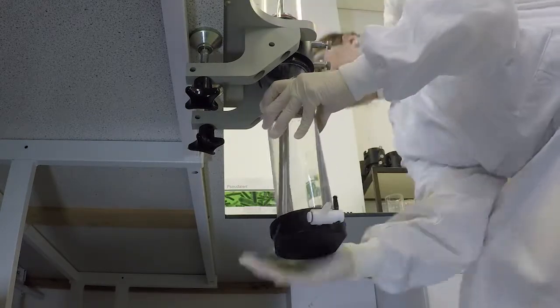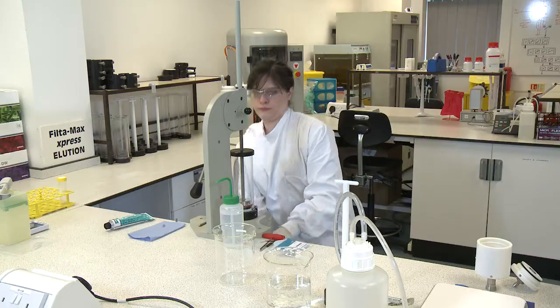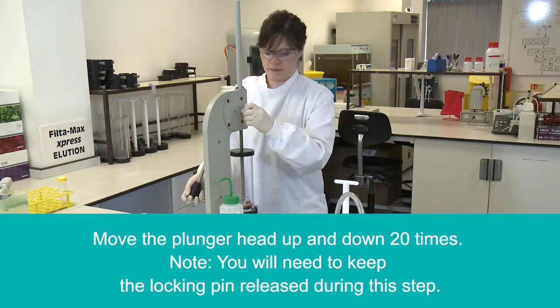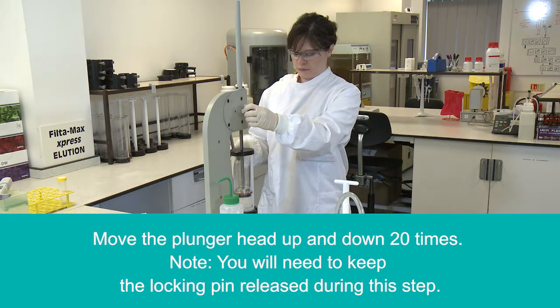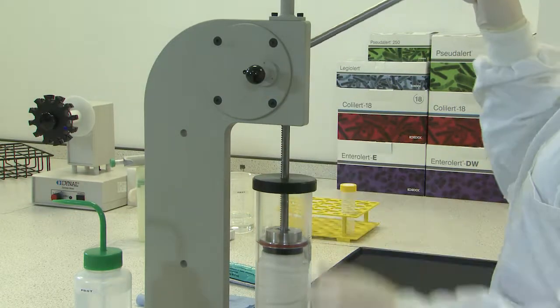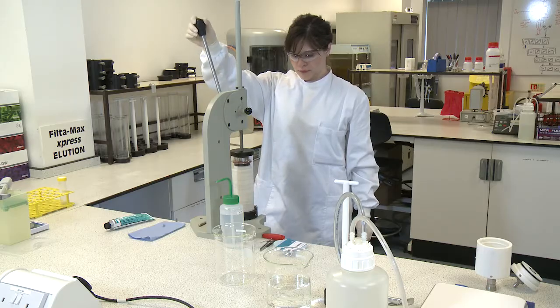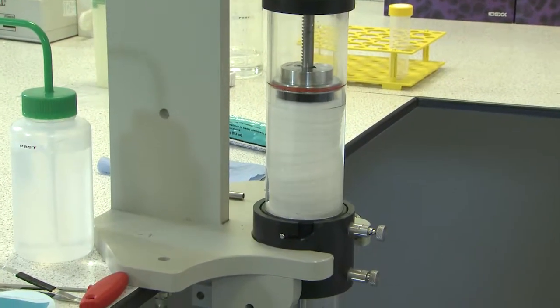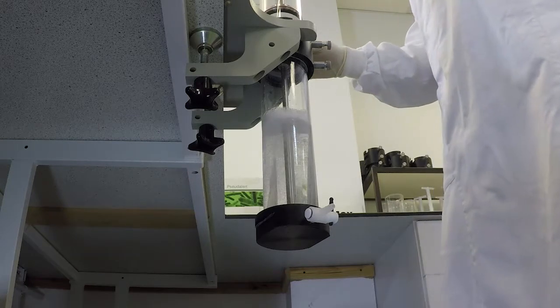Release the locking pin on the wash station and wash the filter module by moving the plunger fully up and down 20 times. Move the plunger very smoothly to avoid generating excess foam.